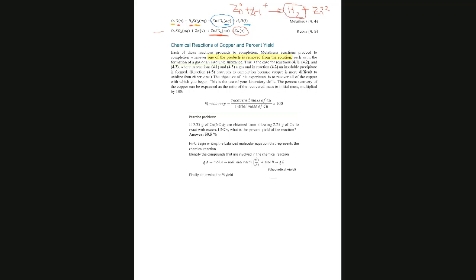And what is our interest? Our interest is in the copper. We want the copper. We add zinc metal, but we don't want to have any zinc metal solid in that solution. We want to oxidize all the zinc and have the zinc as zinc plus 2.